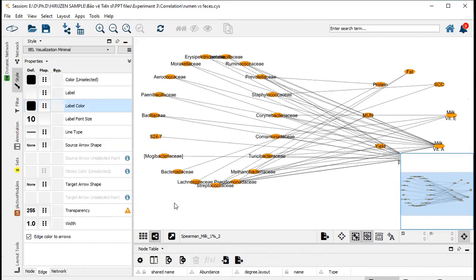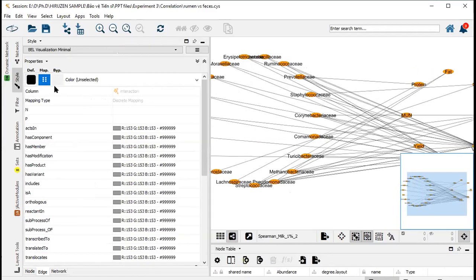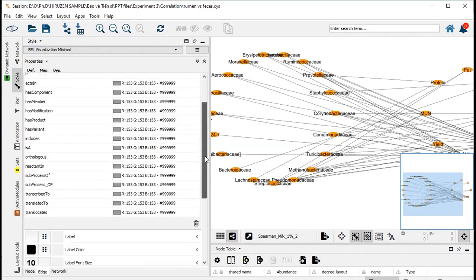And why it didn't change? You press OK. Let me see. And I choose wrong. Here should be color here. This to label to change the color of the edge to this color. This first column here. I choose wrong.